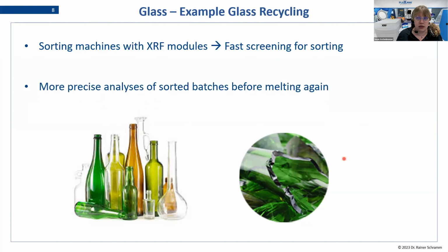XRF is also used for the more precise analysis of sorted batches that are already pre-sorted. Before melting again, the batches are analyzed once more, just to be sure that the correct recycling material is used here.